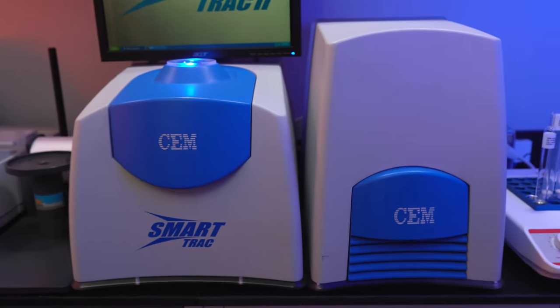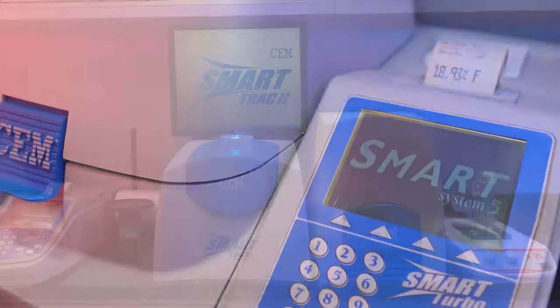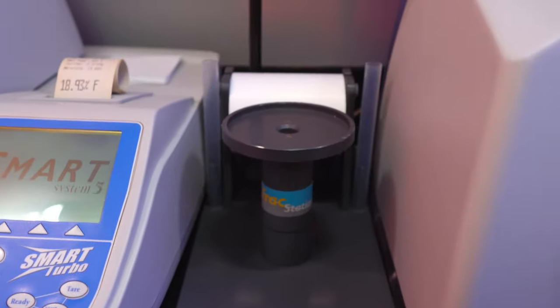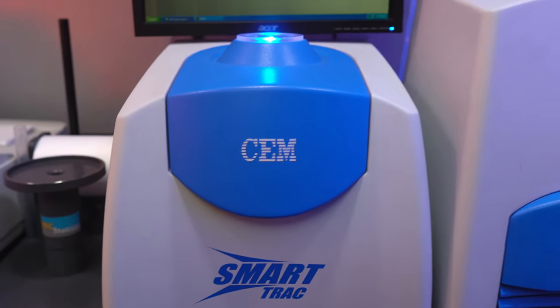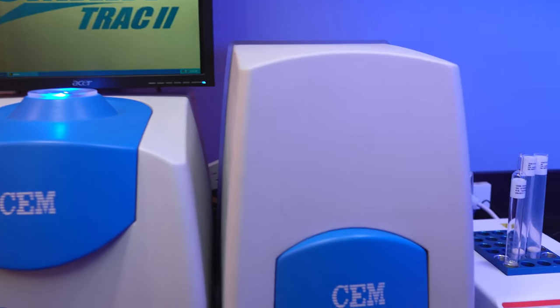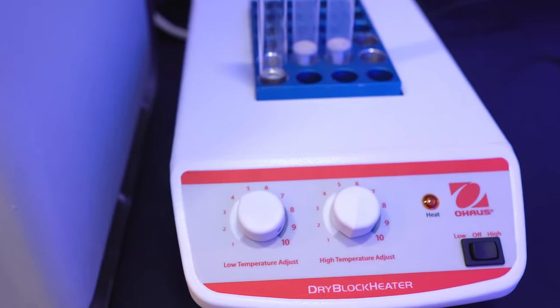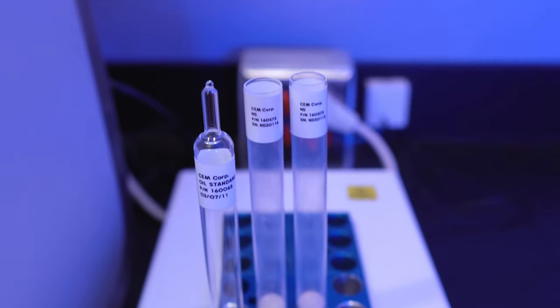This is the CM SmartTrack 2 Rapid Fat and Moisture Solid Analyzer. This system consisting of five separate components combines the microwave drying abilities of a moisture solid analyzer with nuclear magnetic resonance to accurately measure the fat content of almost any food product. This method of fat analysis is fast and non-destructive because it does not involve the use of harsh chemicals to determine the fat content, but rather directly measures fat using signal to mass ratio.